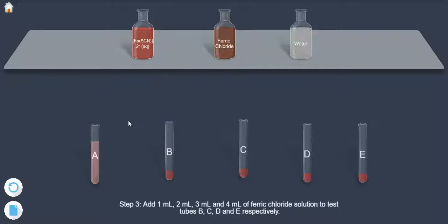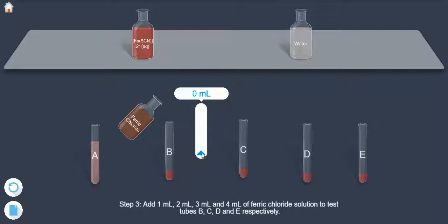Add 1 ml, 2 ml, 3 ml and 4 ml of ferric chloride solution to test tubes B, C, D and E respectively.